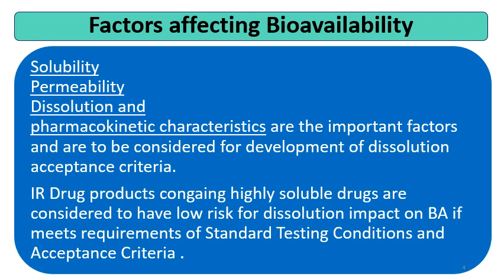Then what are the factors affecting bioavailability? Solubility of the drug substance, permeability of the drug substance, dissolution of the dosage form, and pharmacokinetics of the drug substance. These are important factors and are required to be considered for dissolution development and setting the acceptance criteria for dissolution.